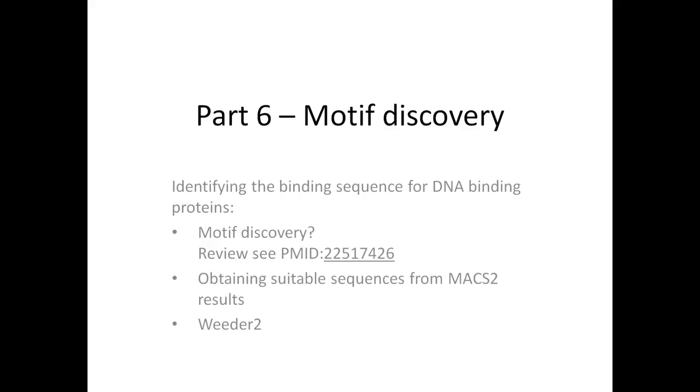I showed in part 5 of this series how to obtain this sequence using Galaxy. So my program of choice is called Weeder. I've been using it a long time. In 2014 it got updated to version 2, adding some improvements to make it simpler to use and with some better functionality.